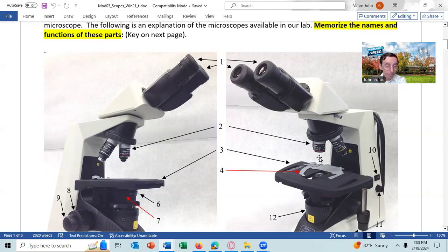In our microscopes, and this is true for the microscopes in the microbiology lab at Clark College, our objective lenses are four lenses on a rotating nose piece, and you can rotate this around. That would be the 4x lens there. That's the 100x lens there. Next to the 4x lens over here, which you can barely see, is the 10x lens.